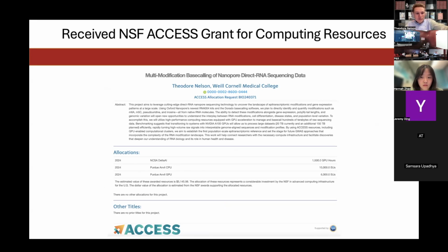You might not need it for the homework in the class, but if you do a lot of it for lab work, you'll need it. The only reason I'm going to do all the base calling for any samples that you work with, and not have you do it on the Purdue Anvil GPU, is because the GPU resources they offer have a 3 to 4 week wait time, which would not fit the timeline for this class. But the CPU resources should be readily available, and are much less used than the GPU resources.